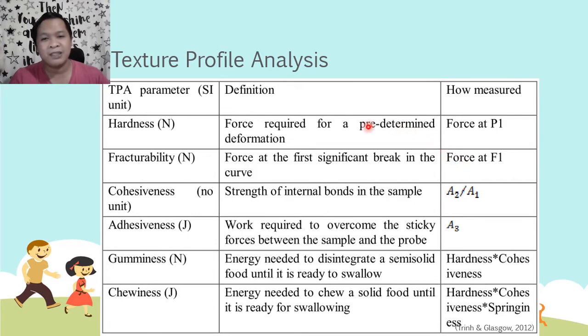If it happens at the predetermined compression, that may not make much sense, no? Kasi pinili mo yung predetermined compression na yon. But sometimes it happens before that.